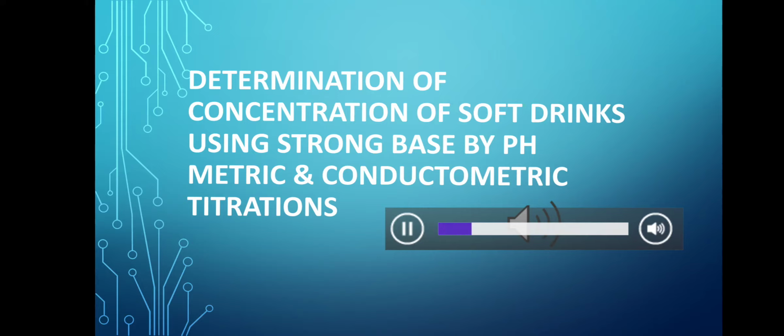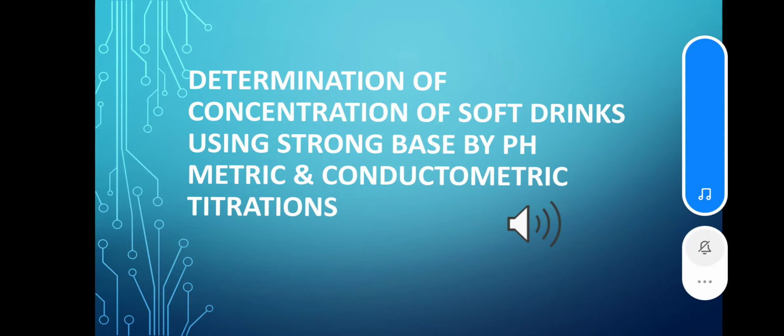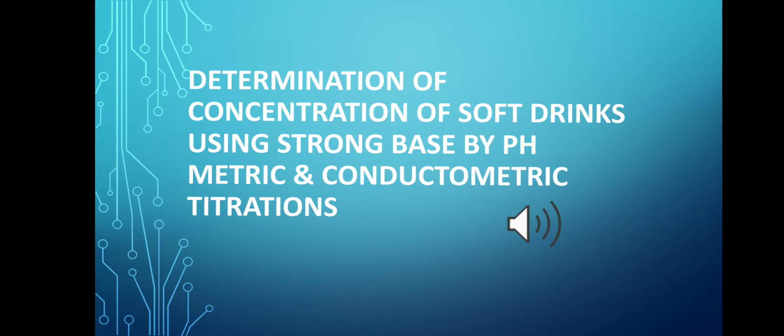I am Joshna. I am here to discuss the experiment: determination of the concentration of soft drinks using a strong base by both pH metric and conductometric titration. I did this project along with my classmates Yuvraju, Sai Kiran and Ajay.